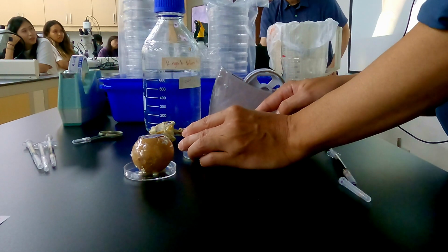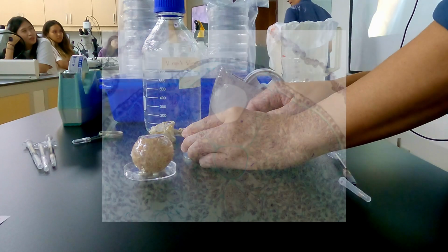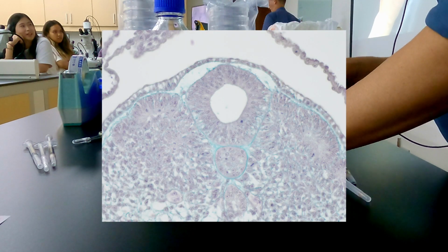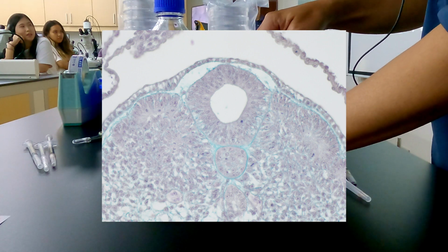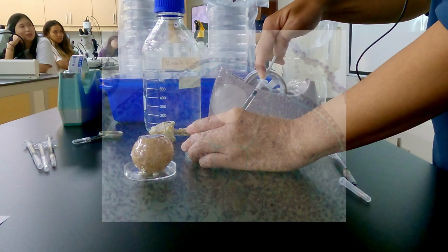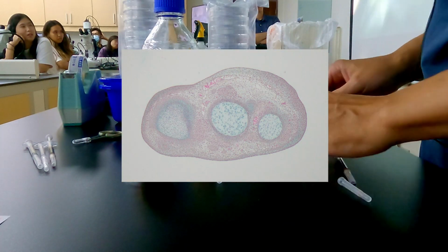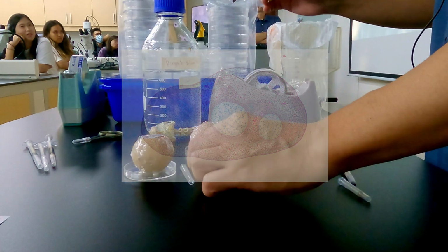Okay, moving beyond the flat diagrams, and this specific protocol focuses on a couple of key areas for observation. It does, yeah. The main focus is observing somites. These are the precursors, the building blocks for the axial skeleton and muscles. Right, the backbone and associated muscles. And also creating tissue sections of limb buds, those little bumps that pop out on the side. The very beginnings of arms and legs. That's them, seeing how they start to form.